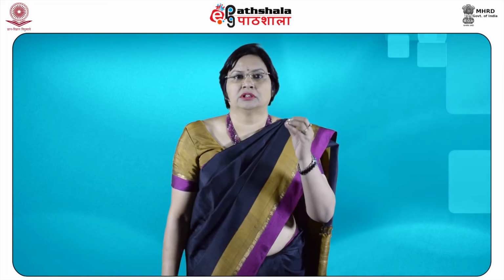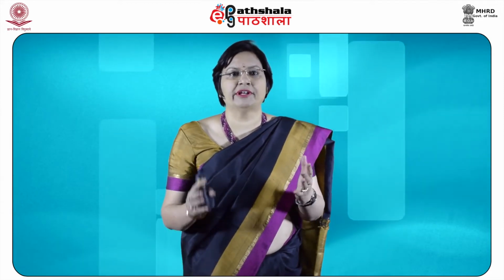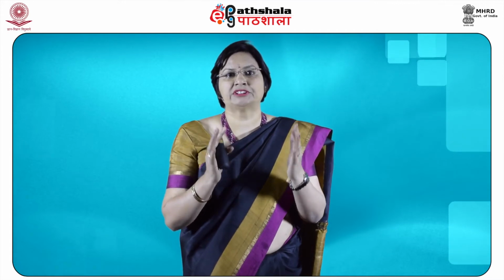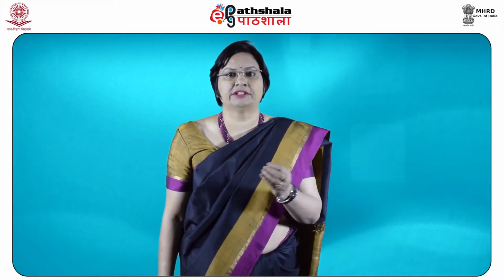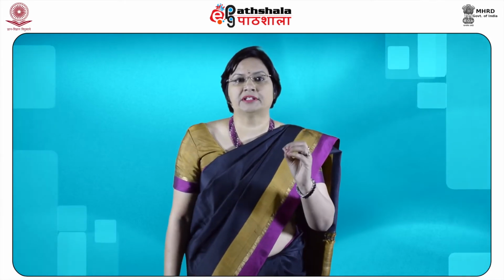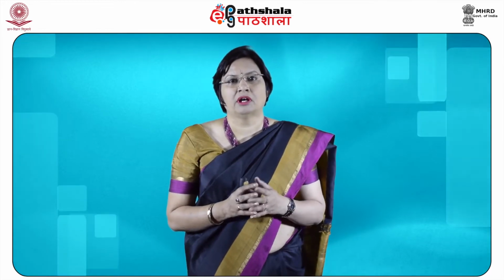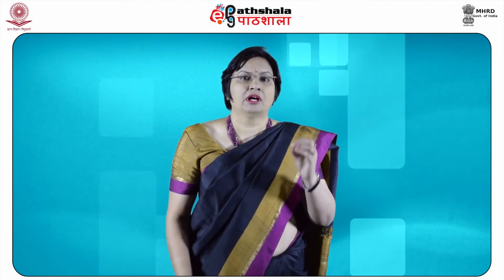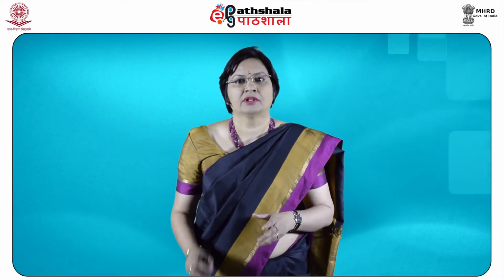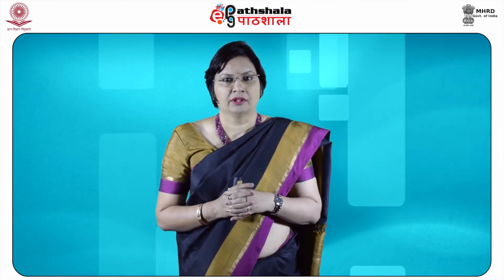We shall talk about the natural abundance of 13C, 19F, 31P nuclei, the spinning nucleus, the effect of external magnetic field, how the precessional motion and frequency vary, the energy transitions, chemical shift and its measurement, how it is done. We shall also study the factors which influence the chemical shift during the NMR spectroscopy measurement, the anisotropic effects, integrals of protons, how the spin-spin coupling, the splitting theory, how to calculate the magnitude of coupling constant, simple, virtual, complex spin-spin coupling, then chemical and magnetic equivalence, how to find out and what will be the impact on the NMR spectra.